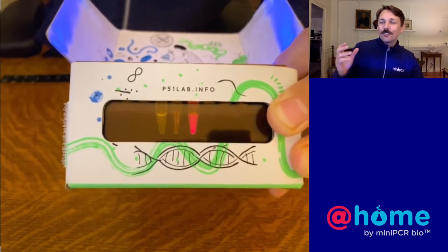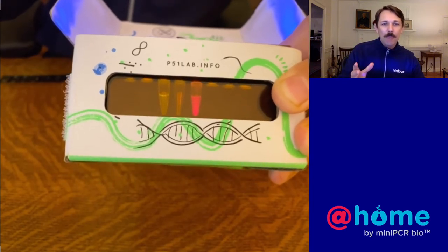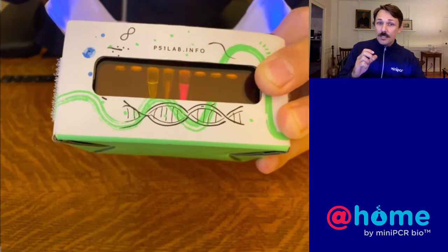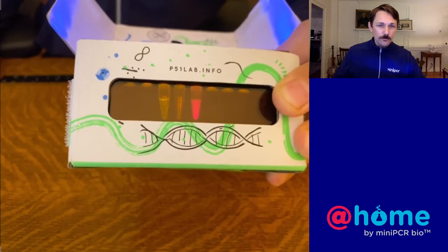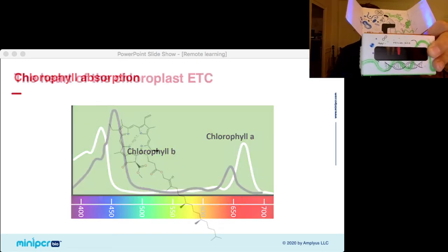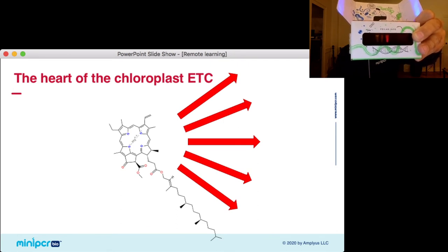So again, the chlorophyll now, it's not in the electron transport chain. So the light is hitting it, it's absorbing that light, and then it's releasing that light back out as red light. The chlorophyll in that leaf is doing a similar thing. It's absorbing the light, and then it has to release it, but it has an electron transport chain to release that light into. We'll just look at that for one more second. It's pretty fun. So again, the chlorophyll absorbs blue light and will release red light.